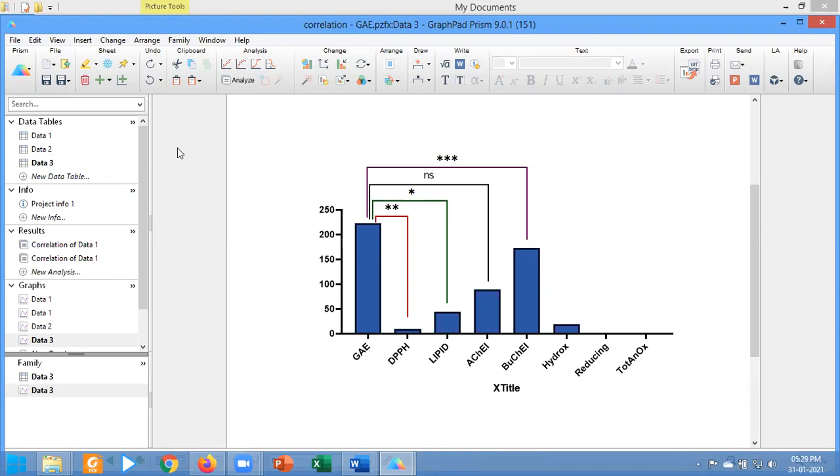Hello and welcome to our today's tutorial. I am going to demonstrate how you can represent your Pearson correlation data with a graph using GraphPad Prism.